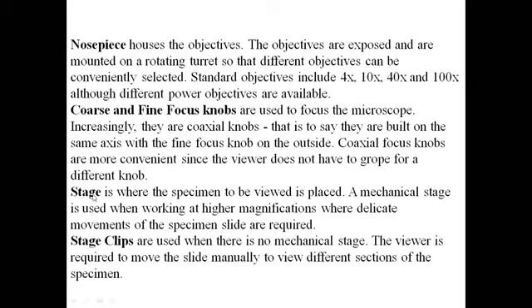Then we have the stage, obviously the place or platform where the sample is kept or where you keep your slides. Then you have the stage clips. The stage clips will help you to hold the sample or the slide. At times you can operate the stage manually also. You can shift the stage left to right, forward, backward also. Some microscopes have this function.